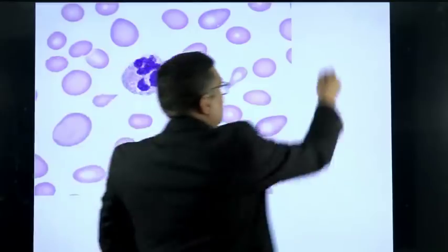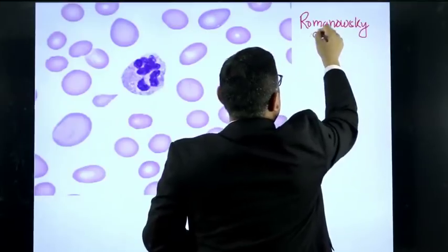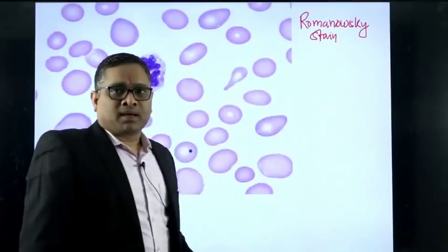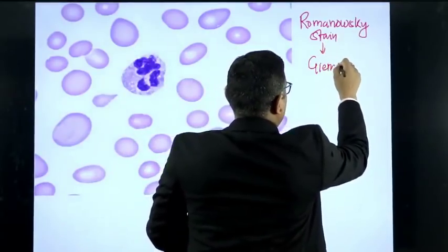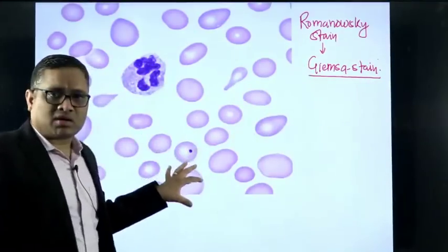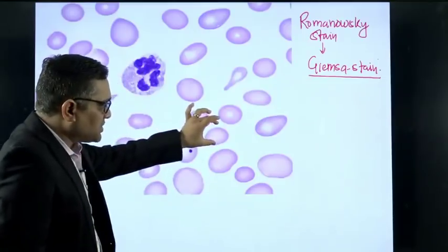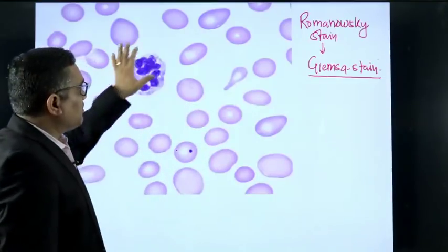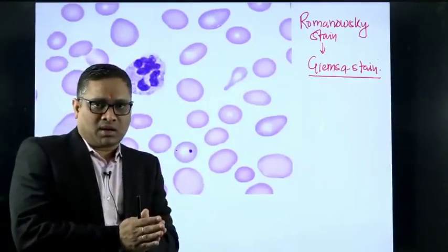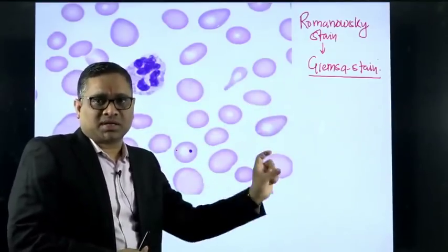This stain is broadly known as Romanovski stain. Romanovski stain is a family of stains, and one of the important stains in that family is the Giemsa stain, which we are looking at right now. We can identify it as a Giemsa stain because the RBCs appear red or orange in color and the background is pale or white.